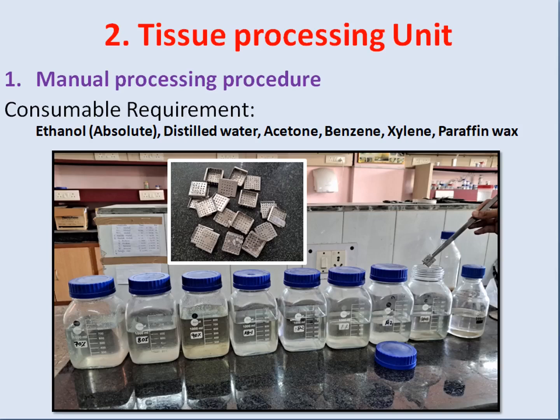2 changes of acetone. Then we have to put this tissue in benzene. So we have to give two changes of benzene. If you do not have benzene, you can use xylene also. So this is a manual process.